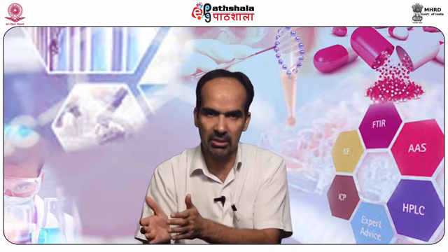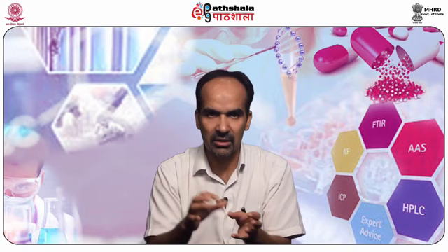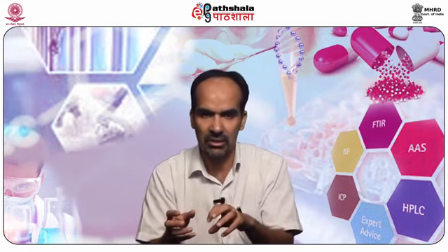It can also be done by generating the steam at some different place and passing that steam onto the material in a utensil or in a flask, so there is no direct contact with water in this case. You generate the steam at one point and then pass it on, and that steam takes away the volatile content and it condenses in a receiver.